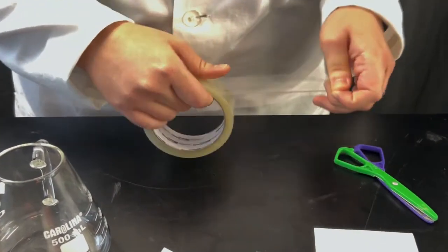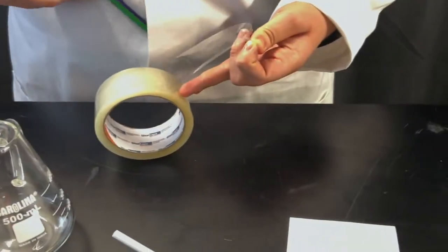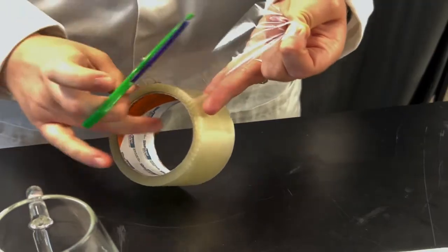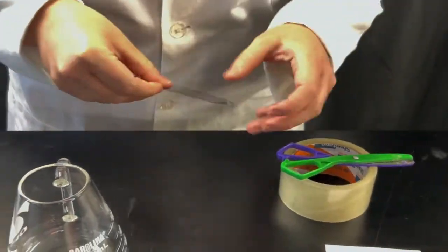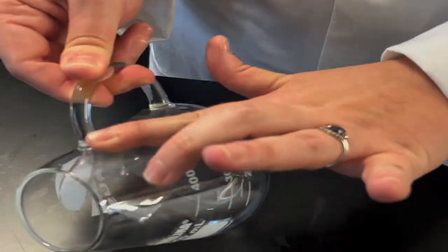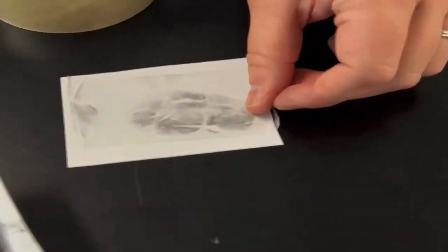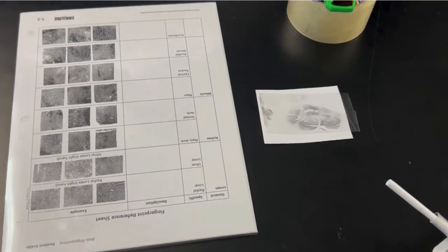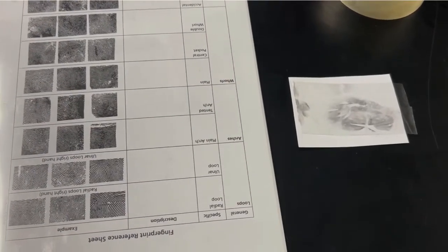To lift the print from the surface, first obtain a piece of fingerprint lifting tape longer on both sides than the length of the prints being lifted. Now place and secure the lifting tape on the developed prints. Gently pull the tape up from one side and place the tape down on a collection card. The print can now be documented and analyzed to identify fingerprint patterns.